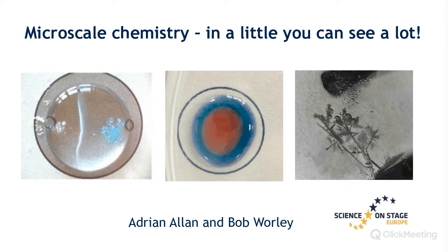As you can see from the title of the slide, this webinar is going to demonstrate some microscale chemistry practical activities, the equipment used, and how it can be used to teach chemistry concepts to students, whether in class or using remote teaching using the internet.